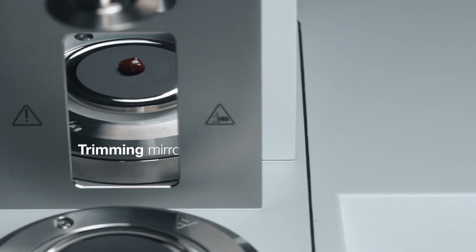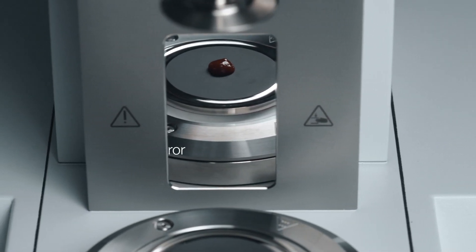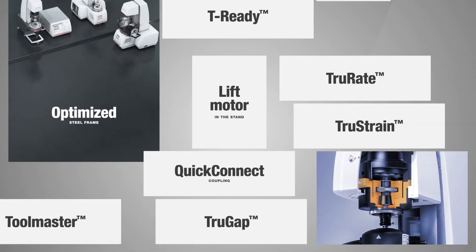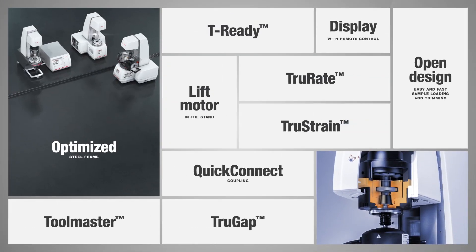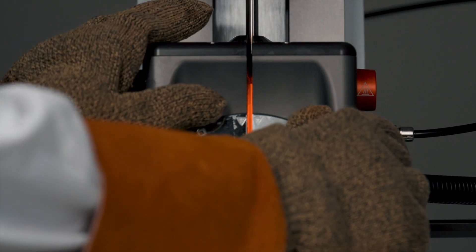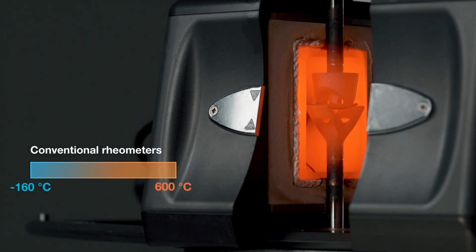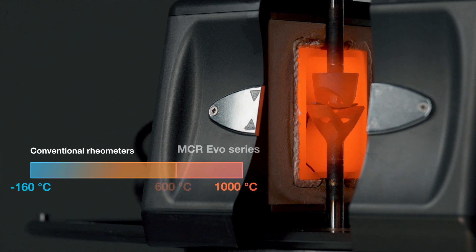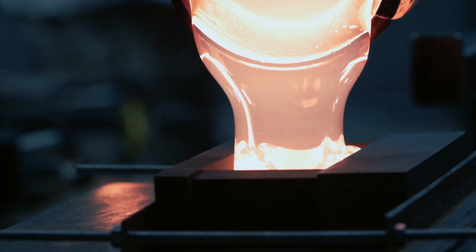A new trimming mirror. A whole array of other features set this standard in instrument usability. The temperature range of minus 160 degrees Celsius to 1,000 degrees Celsius is unique on the market and even allows the analysis of molten glass.